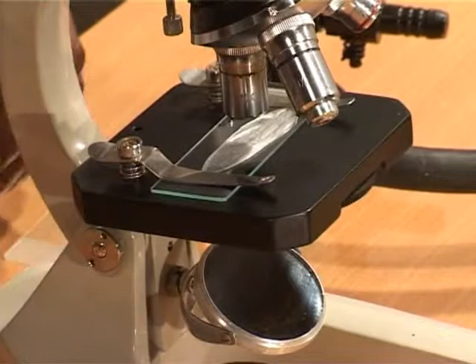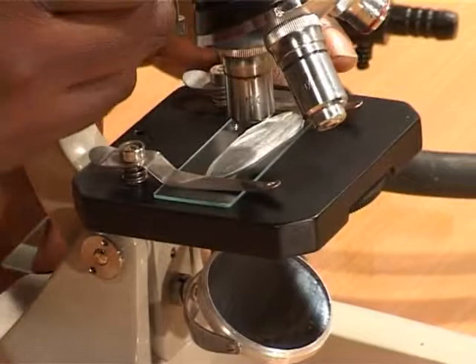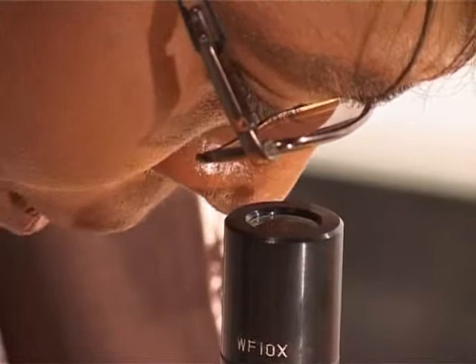After that, we have to now see through the microscope. You keep on adjusting the mirror so that you see properly and clearly.